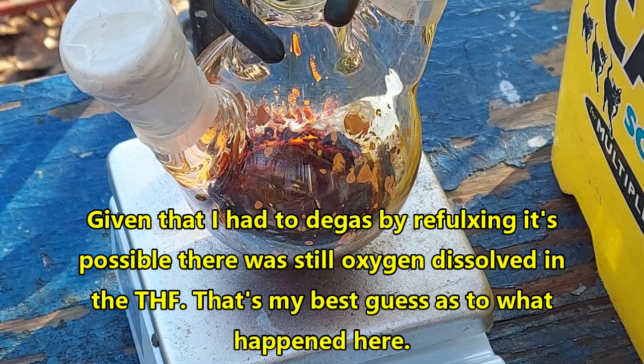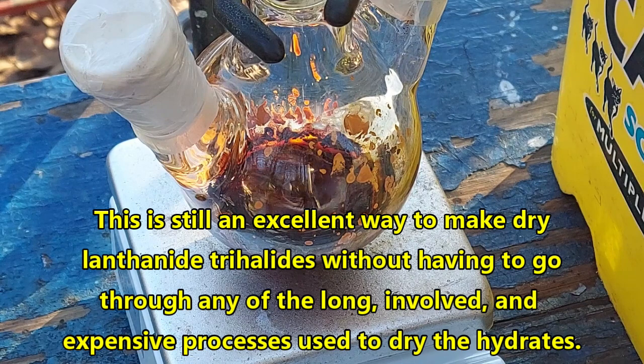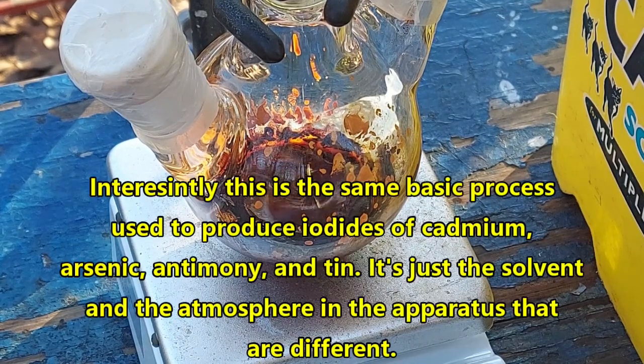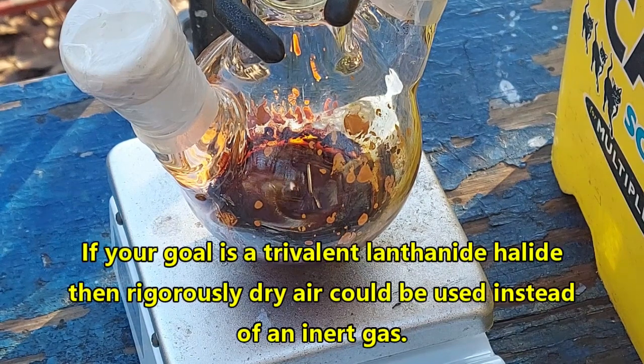Traces of water, traces of air — the apparatus wasn't completely airtight. God has cursed me. But whatever. Like I've said the whole time, even if we get an anhydrous trivalent iodide out of this, that's fine — that is our consolation prize. It kind of looks like that's what we're getting. So I'm going to put it back into the water bath and we're going to keep going and see what we get. Either way, this is becoming a video because I've used so much argon I can't justify not using it as footage.